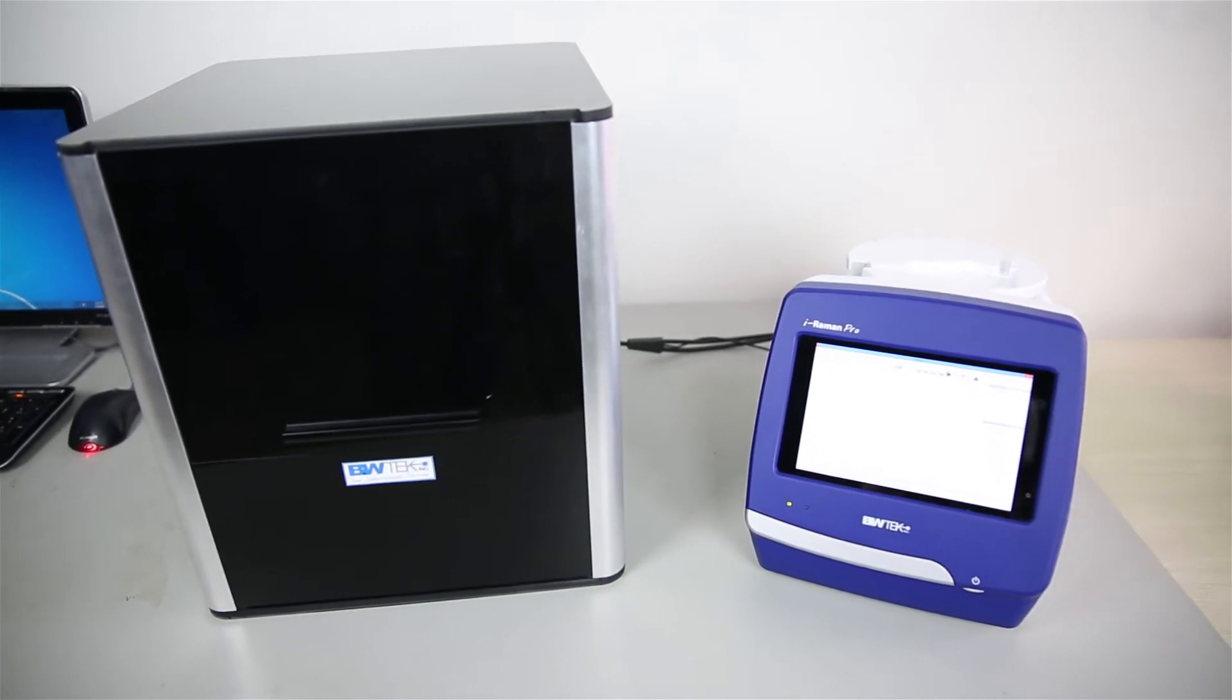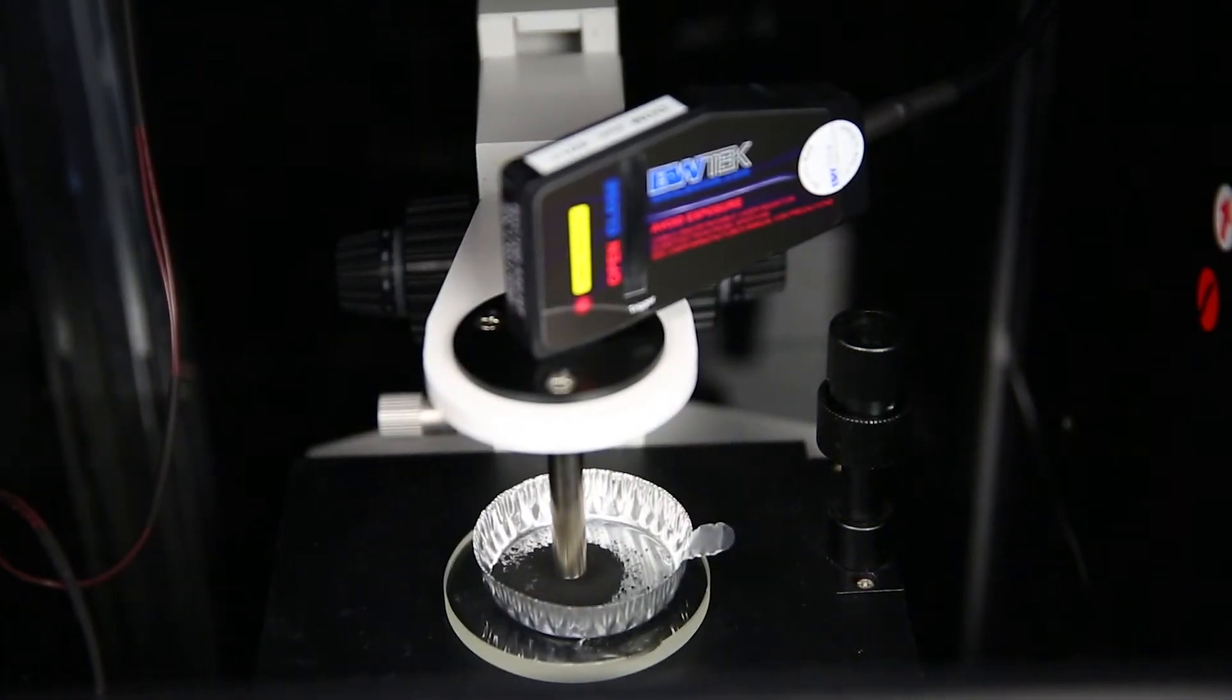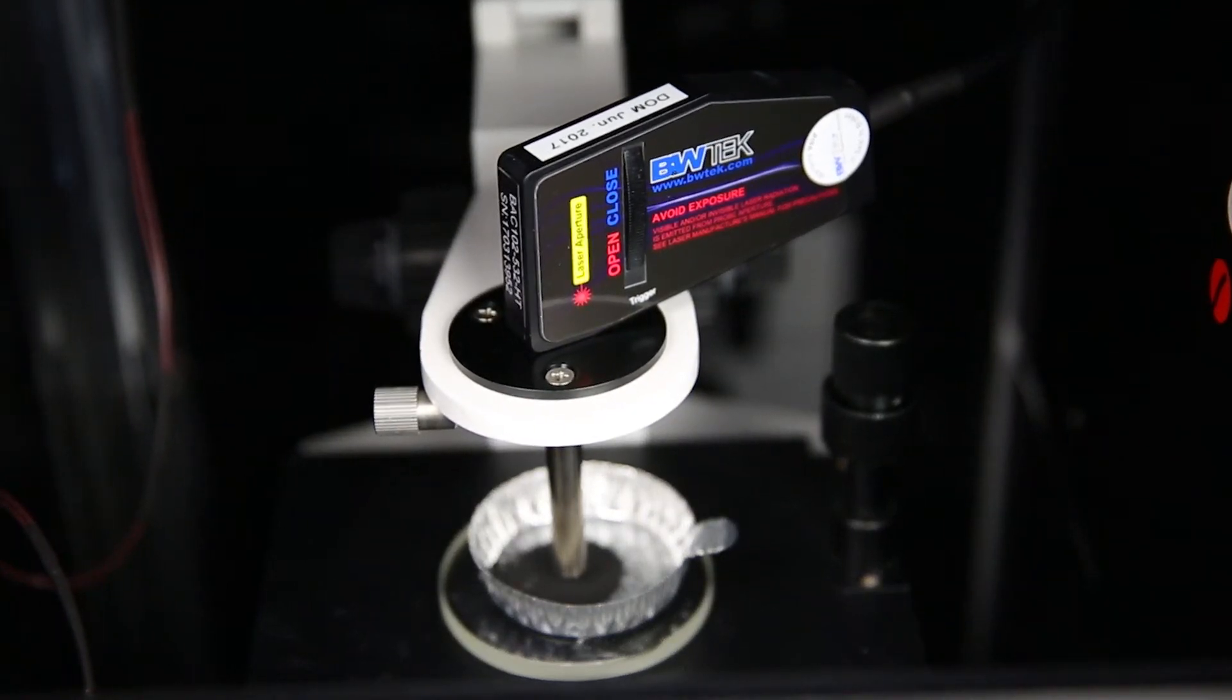The system, with its small footprint and ability to directly make measurements without a microscope, is a suitable tool for both industrial and laboratory settings.